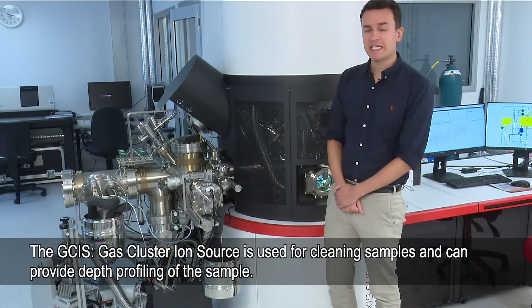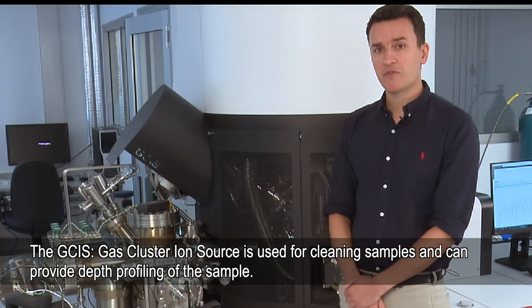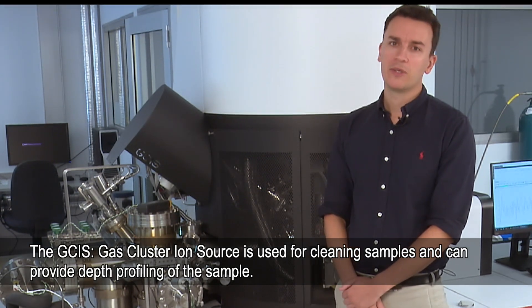This part here on the side is the GCIS — the gas cluster ion source — and that's what we can use for cleaning samples and for doing depth profiles.